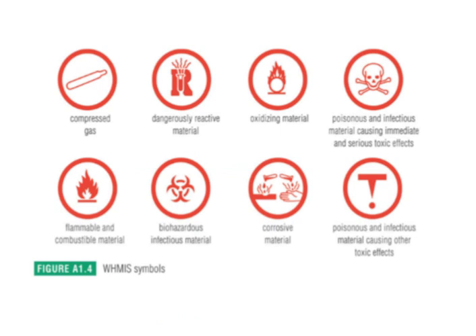This is a compressed gas. We have to be careful about compressed gases because if they ever have a leak in them, it can spray you, and depending on what it is or how much pressure comes out with, it could be quite dangerous. Okay. This is a generic symbol for anything that's dangerously reactive.